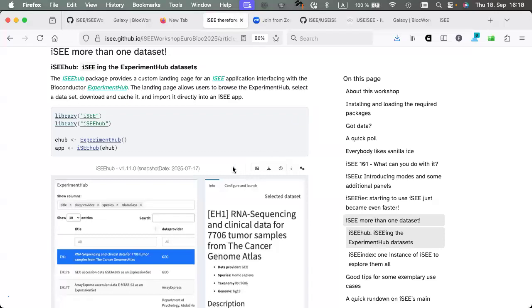So if you want to explore more than one data set, and if you're confident in doing it yourself, try it out. If you'd say, oh, I'm sure, but they just came to us and they said, can you help us in setting this up? And I said, yes, sure. More work, give it to me. But no, it's actually a super cool thing that they thought of our tool to actually display it for that. And I can tell you that editors might love these kind of things because you have a perfectly fantastic content for your data availability section of the paper.